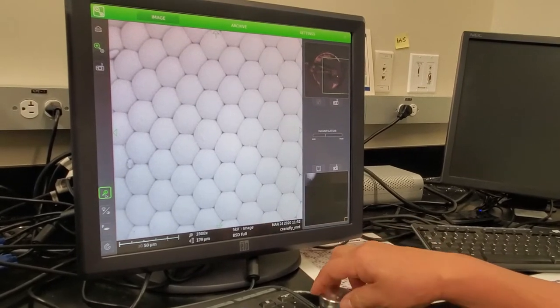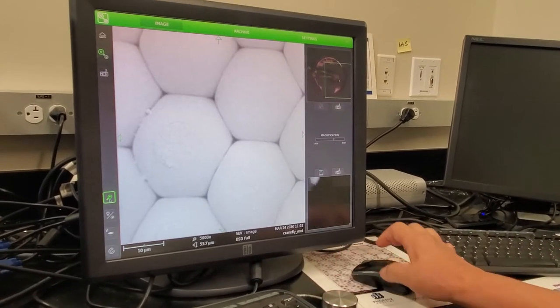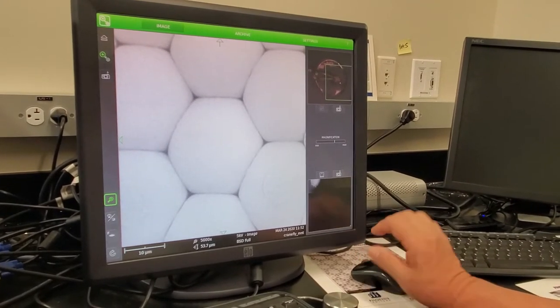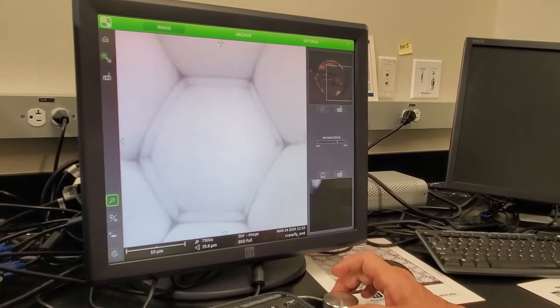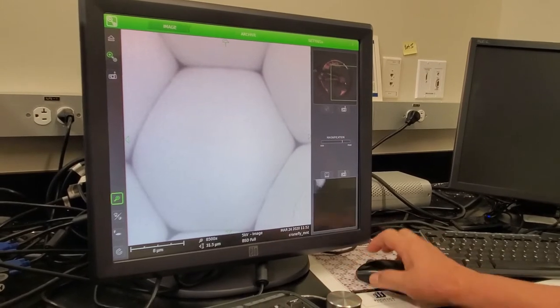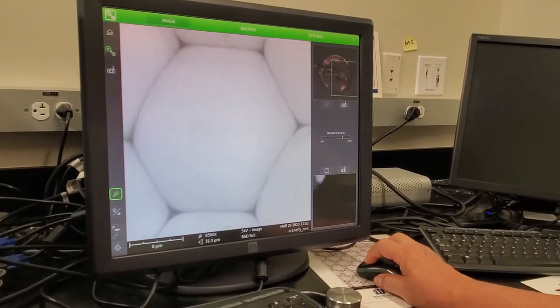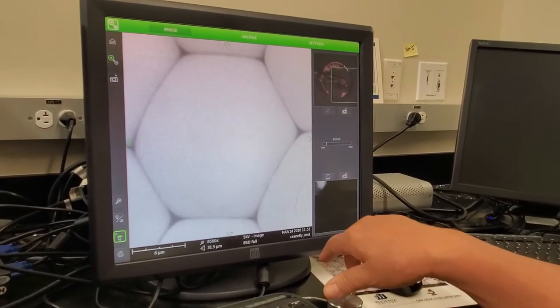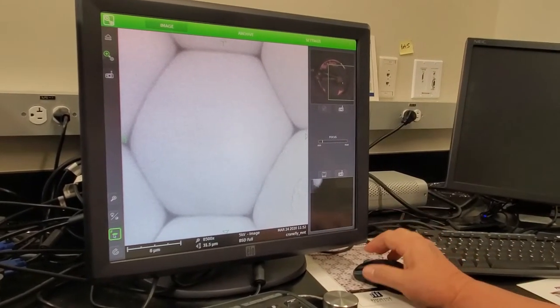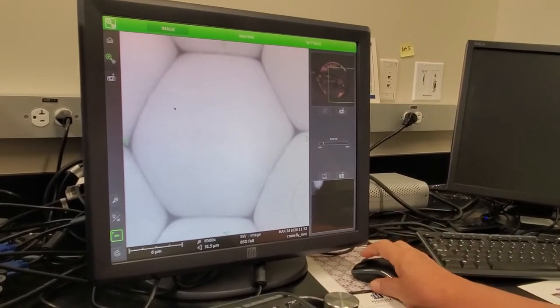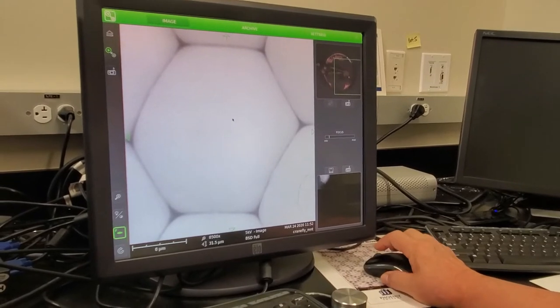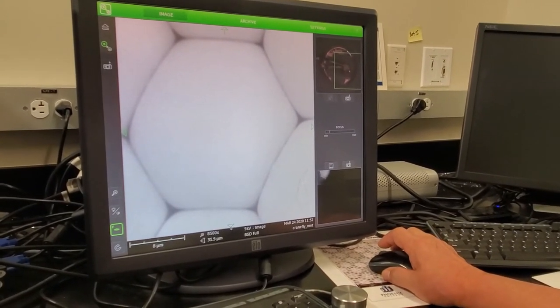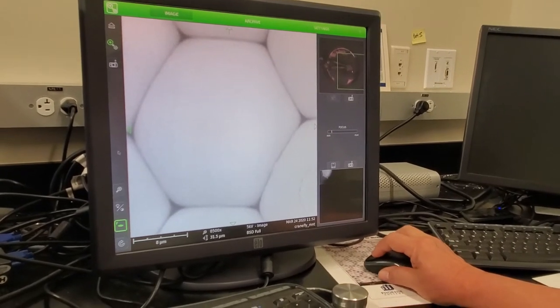Now let's bring it up much closer — go to 5000x. Maybe a little bit more. So we can get more details — that's 8500x. Let's fine focus a little bit and see if we can see textures. Here's the thing: we won't see much texture because this is at 5,000 volts. We'll come back to this later. Take a picture.